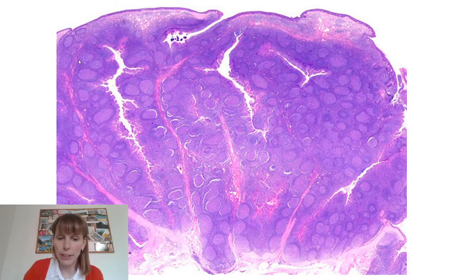the tonsil, of tonsilla palatina. How do you recognize this from, for example, the thymus? Okay, no lobes with cortex and medulla. How do you recognize this is not the spleen? It's because it will not have the red and white pulp, it will not have the central arteries, and also it doesn't have the capsule going around it on all sides, because here the important thing to look for will be the epithelium on one side covering the tonsil. Also you don't have the subcapsular sinus there.